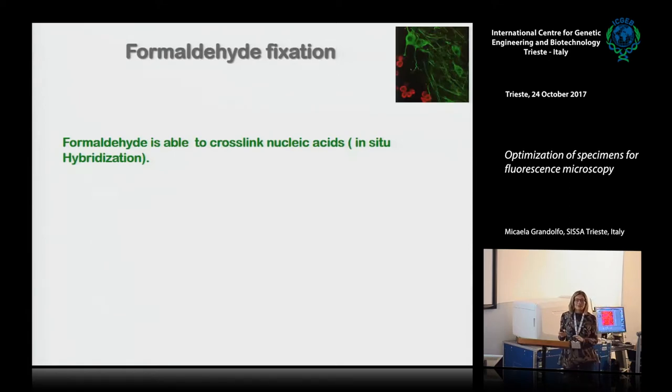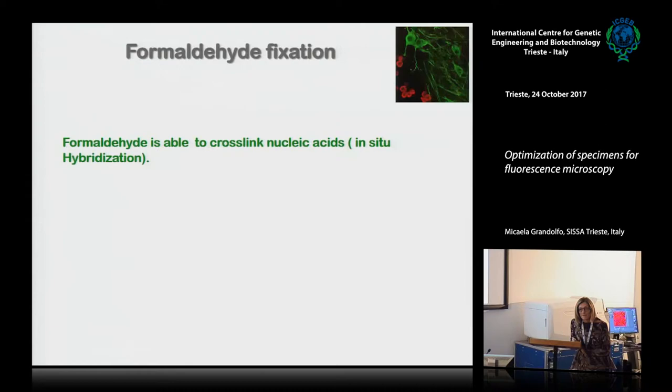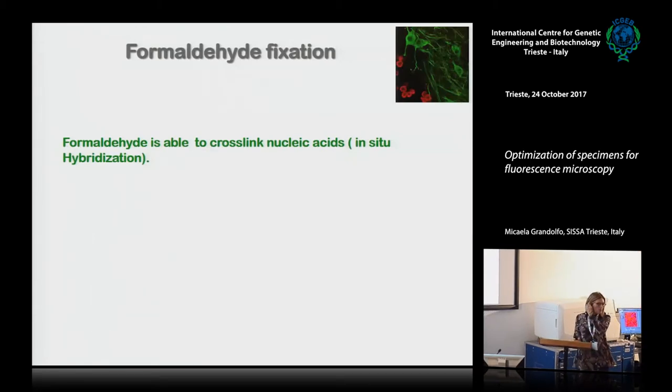Can I just ask a question? Yeah. Is this the same if the PFA is frozen, if you keep it at minus 20, does this reaction occur also? No, you can store it at minus 20, okay, then you thaw and you can use it. I cannot say if there is a very fine difference between the fresh solution and the frozen one. If you want to be really sure you are fixing in a better way, prepare the fresh solution. But of course, you can use the stored solution at minus 20. I think that my suggestion is to use the fresh solution if you have to perfuse some animals. Okay, in this case, yes, it is really critical to use the fresh one.